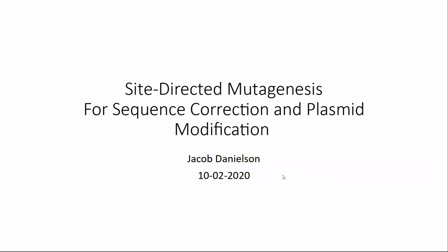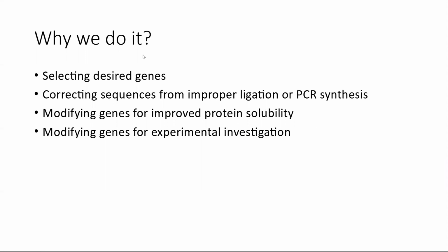Okay, so I'm going to do a quick overview of site-directed mutagenesis for sequence correction and plasmid modification, including what tools you need to use and how you need to use them. My name is Jacob Danielson. So why do we do it?